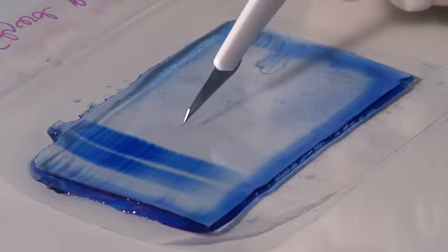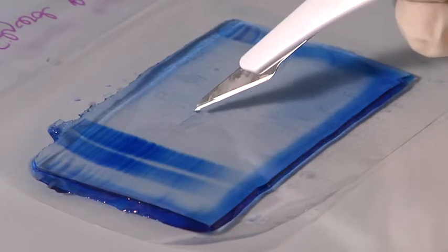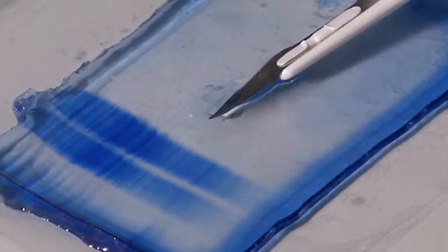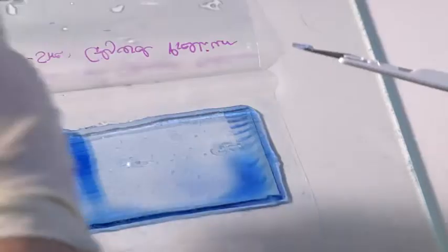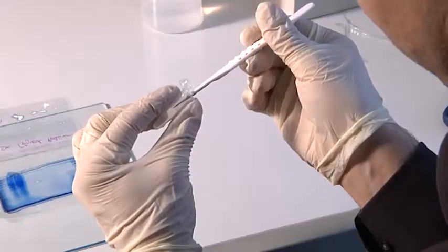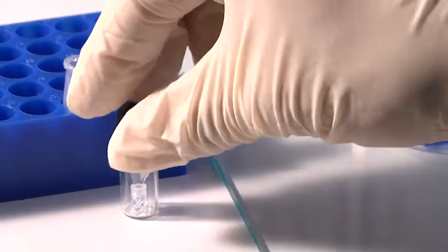To connect protein bands or spots with sequence information, they are cut out of the gel. Proteins in the gel pieces are cut into small peptides by trypsin digestion. The peptide mixtures are stored in dried pellet form for further analysis in a mass spectrometer.